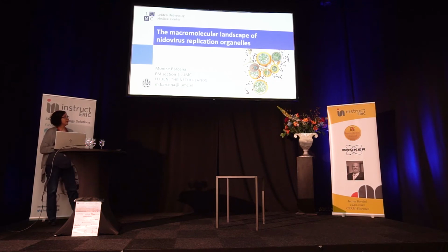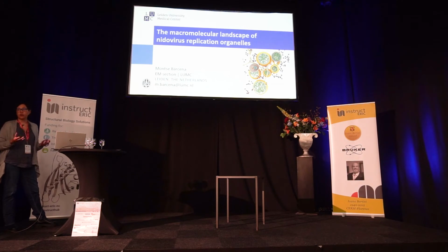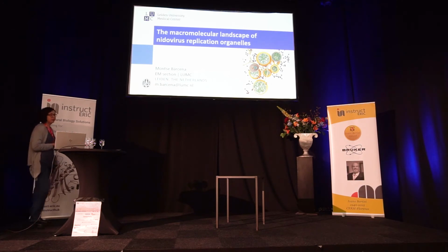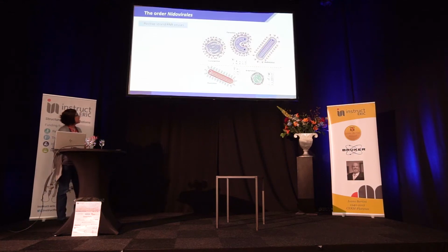And the story I will tell you today, I think, highlights the potential of cellular cryotomography, to do cryotomography in situ, not only to study, as has been emphasized before, known macromolecular complexes in their natural context, their spatial distribution, but also to discover new macromolecular players.